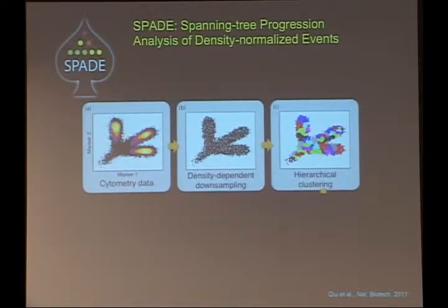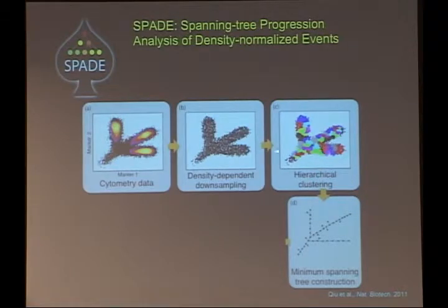But I've lately started calling them microphenotypes, because I think they are very subtle differences in the surface markers generally that we use to draw these trees. And so computationally they are phenotypes, although functionally you would have to use surrogate measures to figure out if they are functionally different cells. And then for visualization purposes, we link together each of these different neighborhoods of cells as a node, a dot, along a branching tree structure, which uses the shortest or simplest path to connect all of the different nodes in the data set.